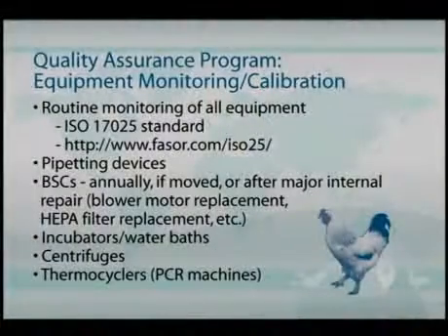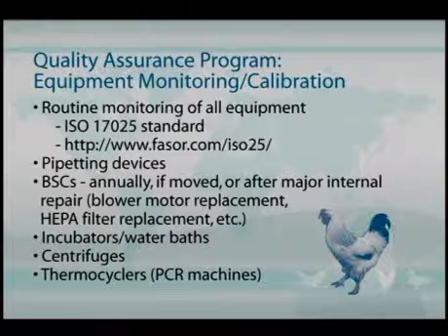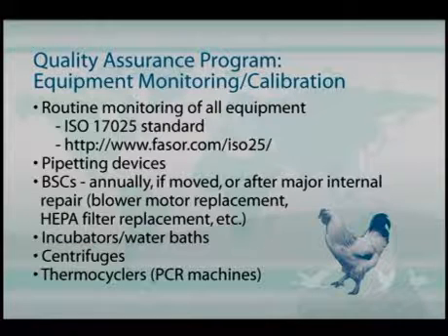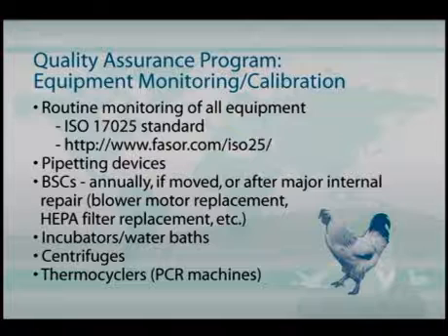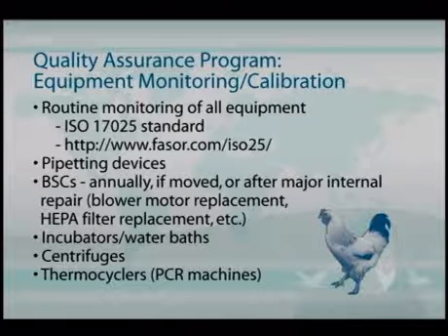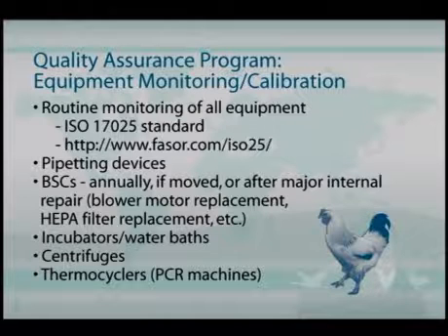And then finally, one thing that probably many of your labs have already started some initiative to attain is quality assurance in your laboratory. Quality assurance is basically a very sophisticated program. Most laboratories are using what they call ISO 17025 standards. I have a website here that you can get some additional information on that particular standard. But what the quality assurance program does is that it's the routine monitoring of all the things that go on within the laboratory, so that it increases the confidence of your customers that the procedures are being performed as they should be.